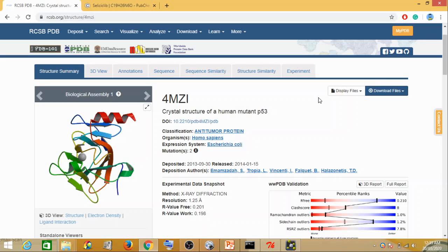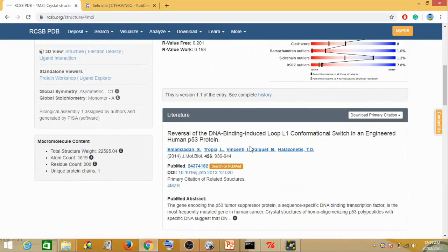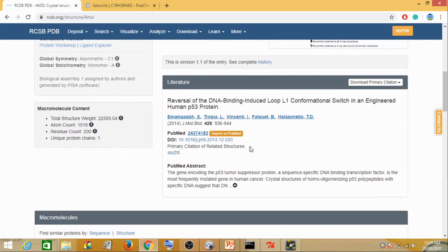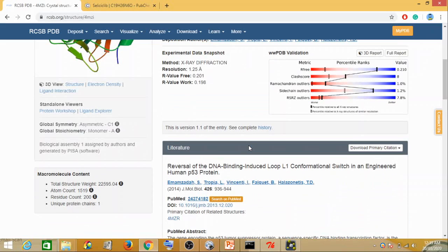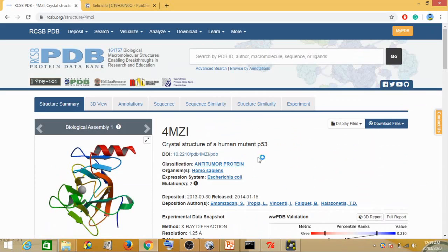The first step is where we choose the protein. The protein we are going to choose right now is the human p53 protein. The p53 protein regulates the cell and functions basically as a tumor suppressor. But when it becomes defective, it allows abnormal cells to proliferate and hence leads to cancer. This p53 protein we are going to download from a database called the Protein Data Bank.